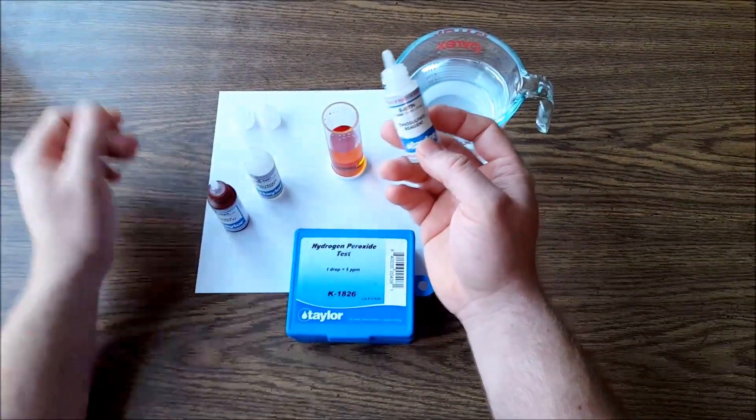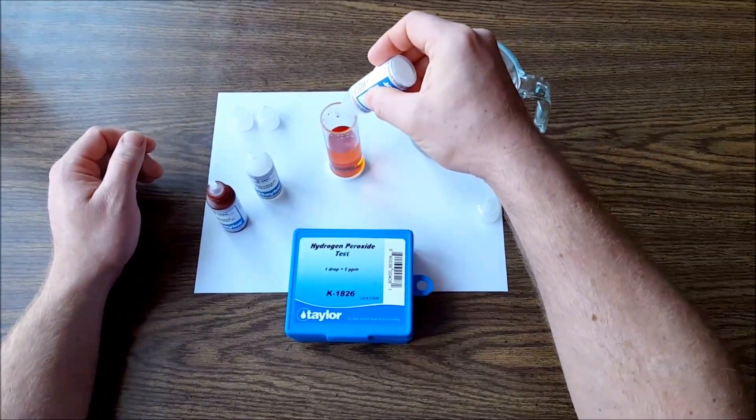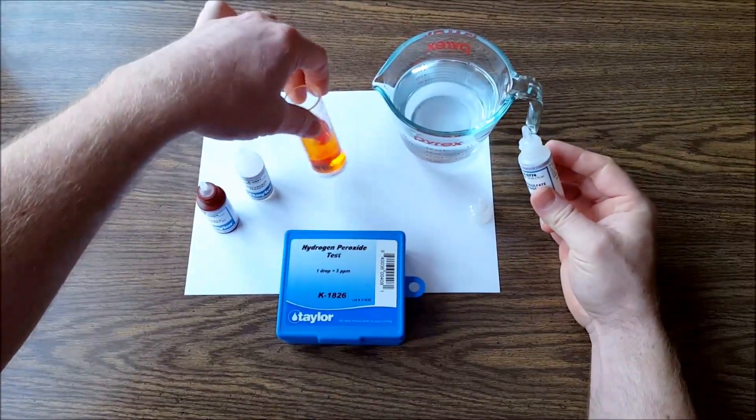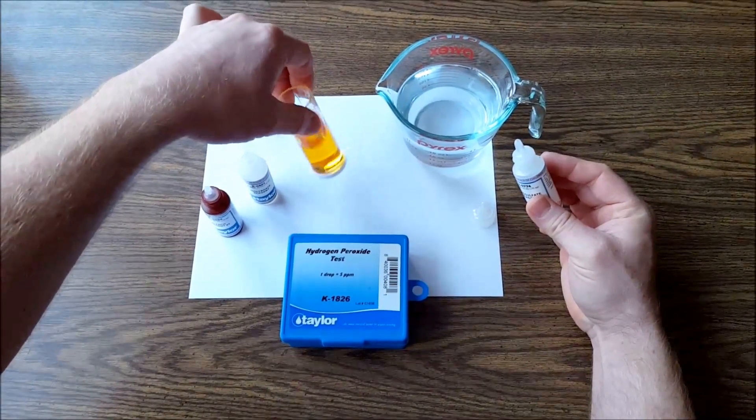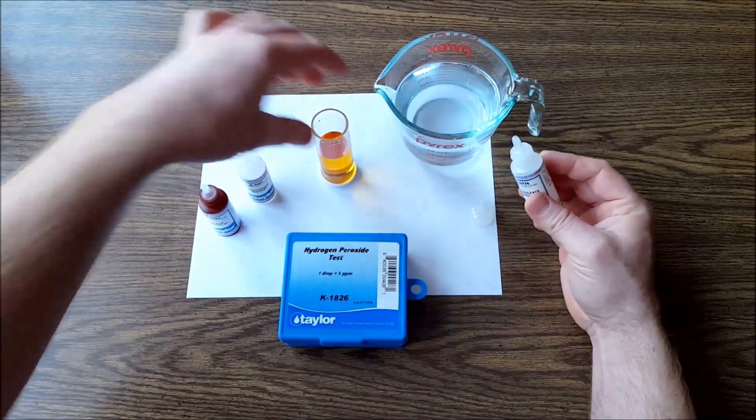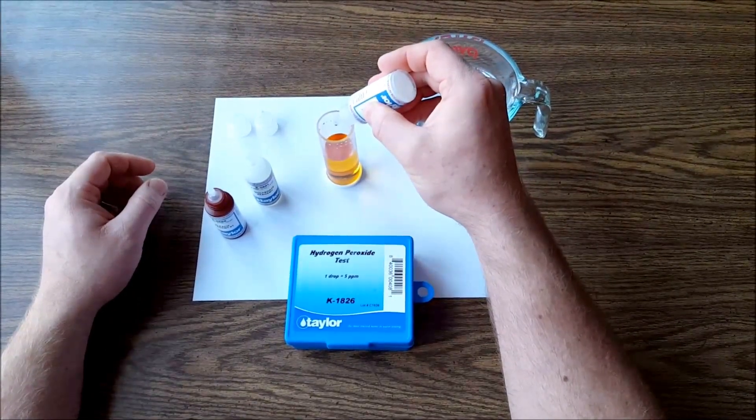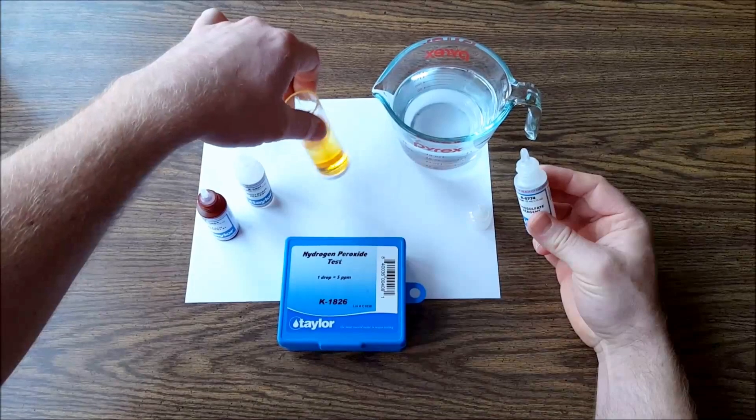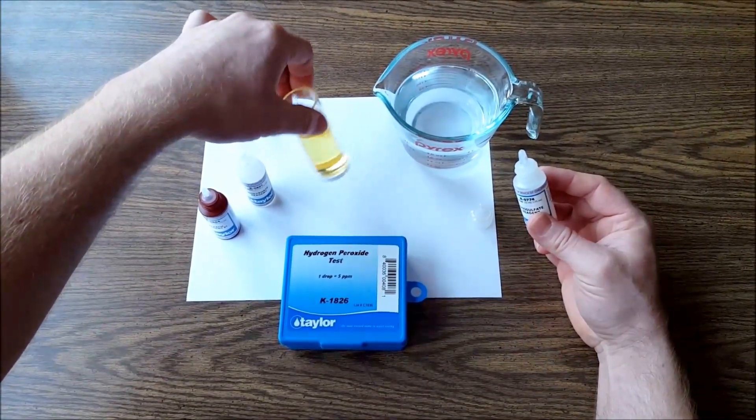So here goes 10 drops: 1, 2, 3, 4, 5, 6, 7, 8, 9, 10. That would equal 50 parts per million right there, and you can see how it clears it up really good. So that's 50. I'm gonna go five drops more: 1, 2, 3, 4, 5—I did six there. So we're at 80 parts per million and that's even better, not totally clear yet.